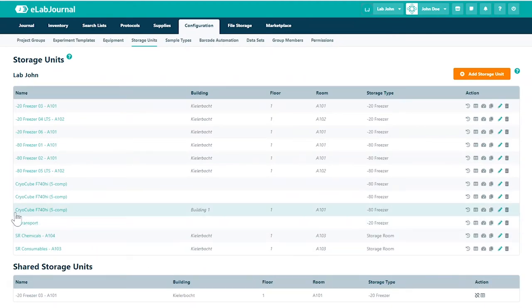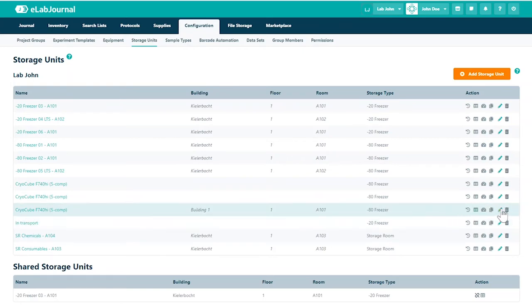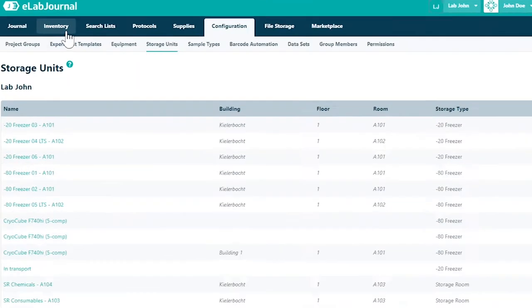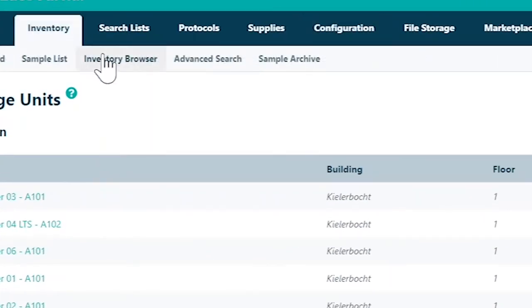You can now see the storage unit you have added. Navigate to the inventory browser to finalize the setup of your new storage unit by adding the required number of compartments.